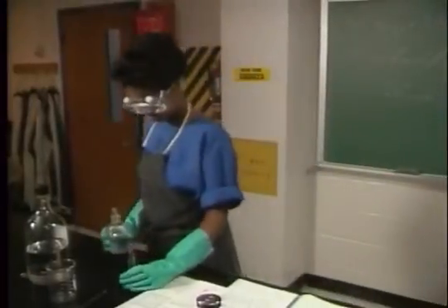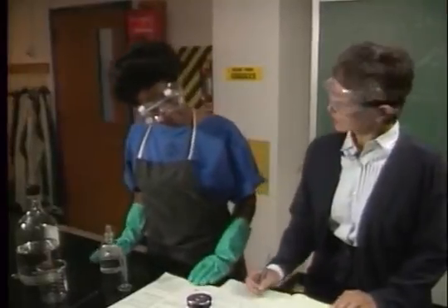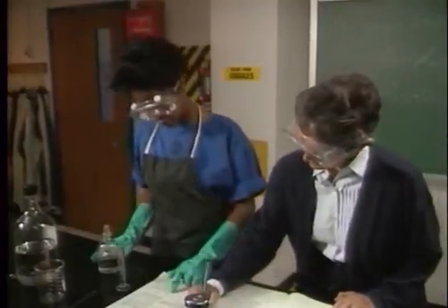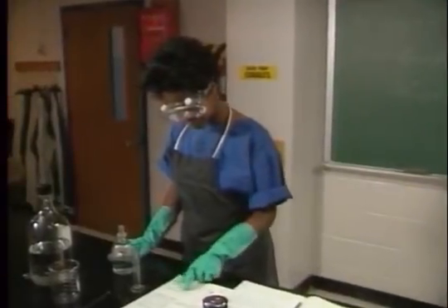Accidents can also happen when mixing chemicals. To be safe, only mix chemicals when your teacher says to.